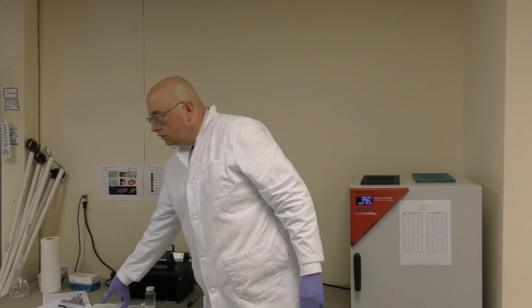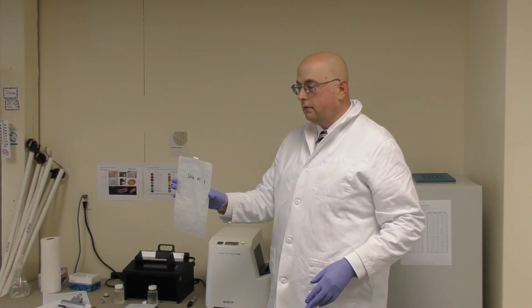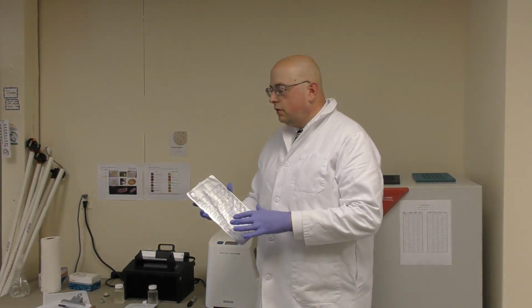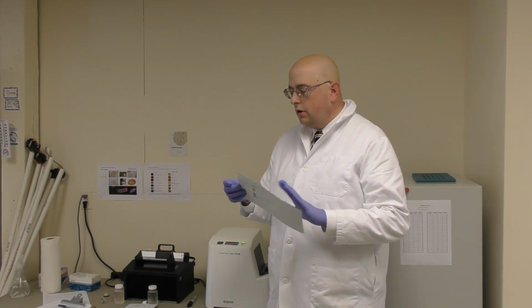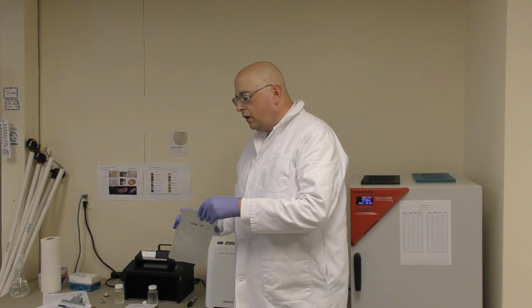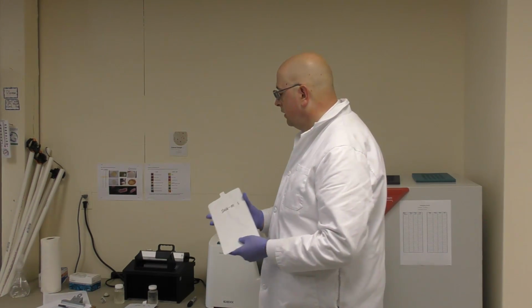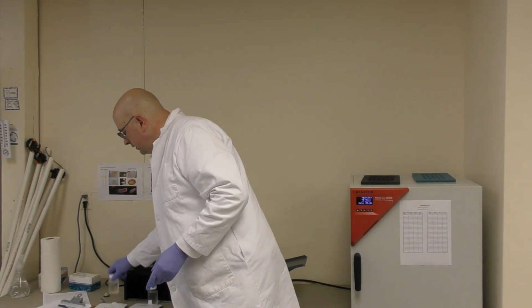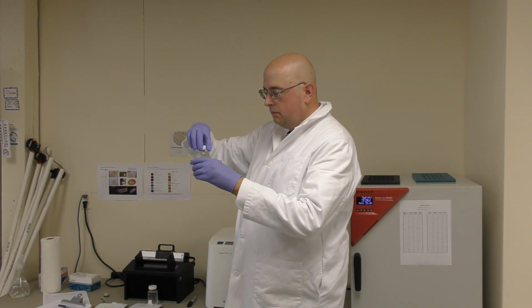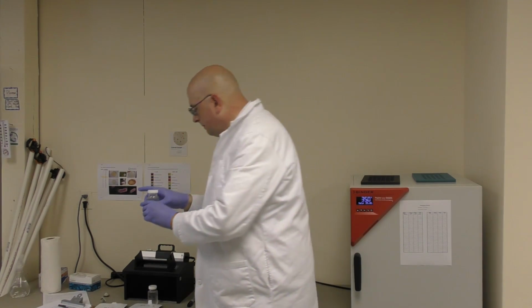So now we're going to fill up the Quanta tray, all right? And so the tray is kept closed, and it's a sterile tray. So when we are accessing it, you don't want to stick anything in there, right? So what we recommend doing is one bottle at a time. Just loosen that bottle lid to just let it sit on top.